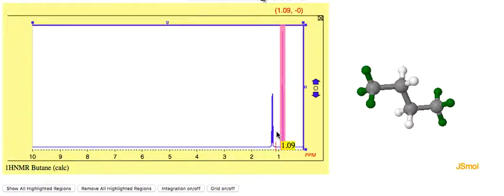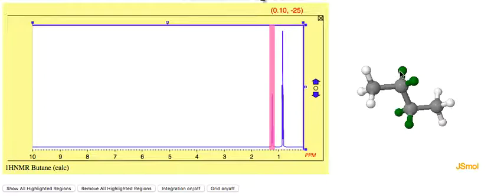1:3 to 3:1 approximately. And these hydrogens here are each going to be split by the 3 hydrogens that are vicinal. The other ones are not considered vicinal because they are identical. Identical is not the same as vicinal. So they're split by 3, so we have a quartet there.